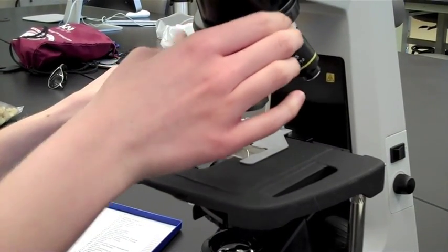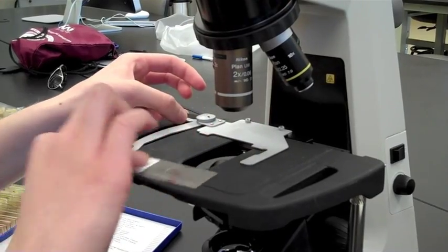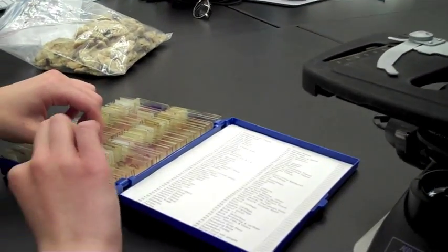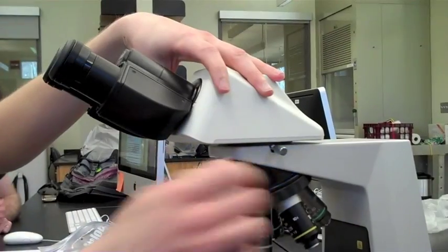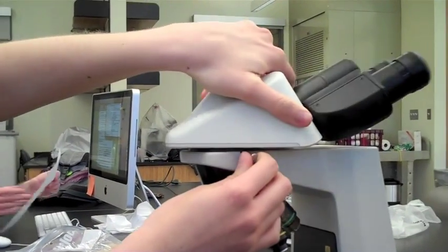Adjust the objective lens and the stage so you can remove the slide and place it back into the box. Close the box. Rotate the eyepiece back over the microscope.